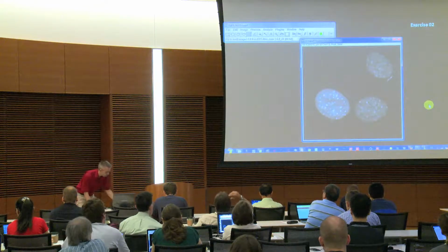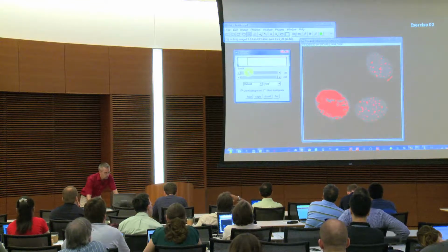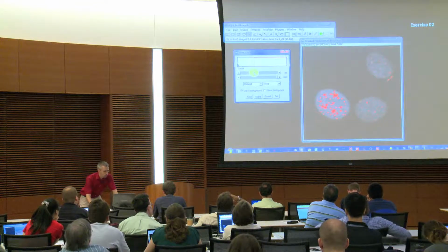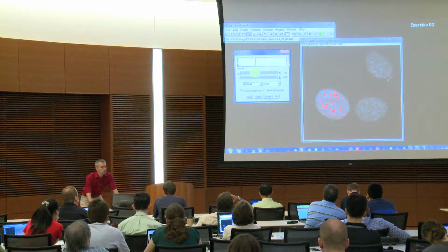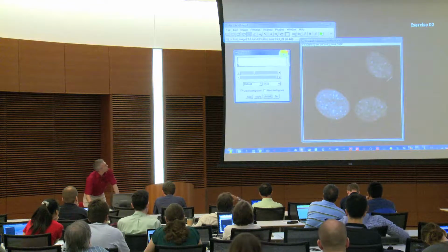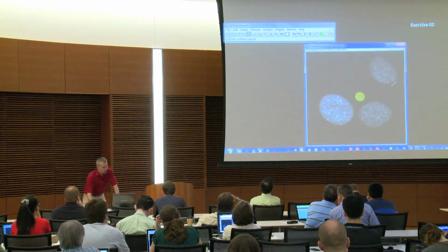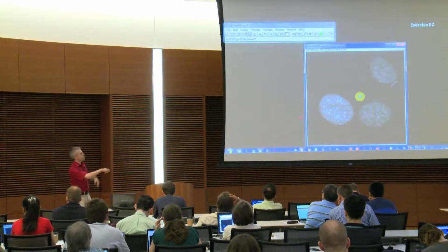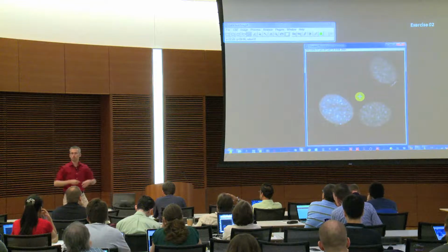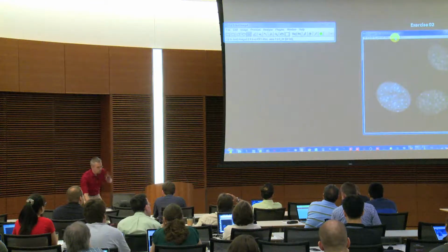So just to show you that here shortly, if I would threshold them, I get either some of the spots here, then I get here too much, or I get it from here and then I lose all the other ones. So like this I can't process the image directly. So what we can use this function I have shown you for is also to actually level these different intensities to a similar or the same level, which later on will help us for the extraction. So we actually misuse it.